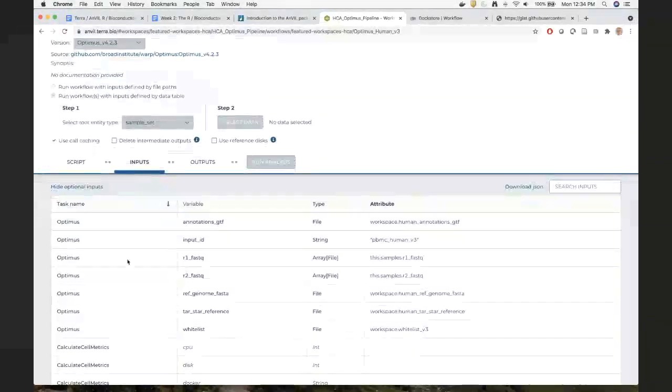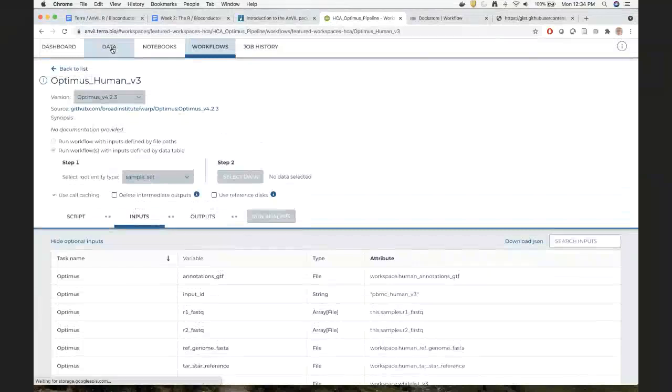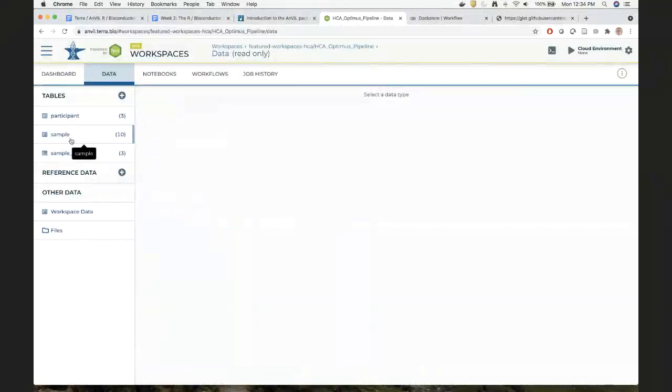And we could probably have pretty good success if we had our own data. We could probably alter this data table to point to our data, and probably the pipeline would work. It's probably been debugged and robust enough that it would work as a first pass anyway.